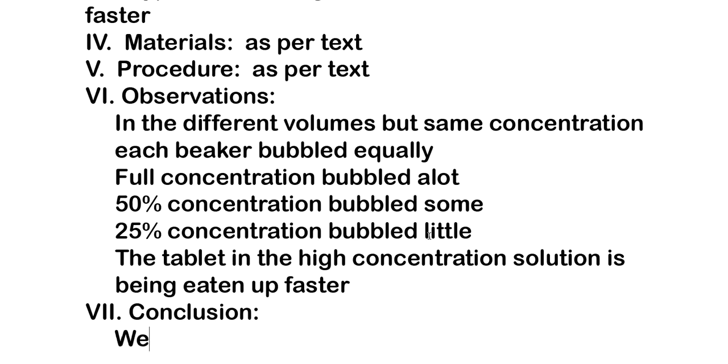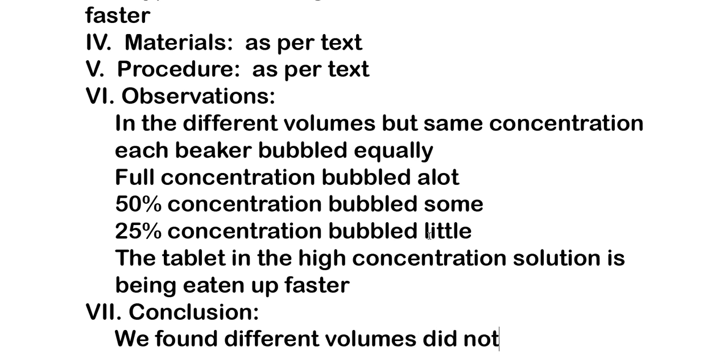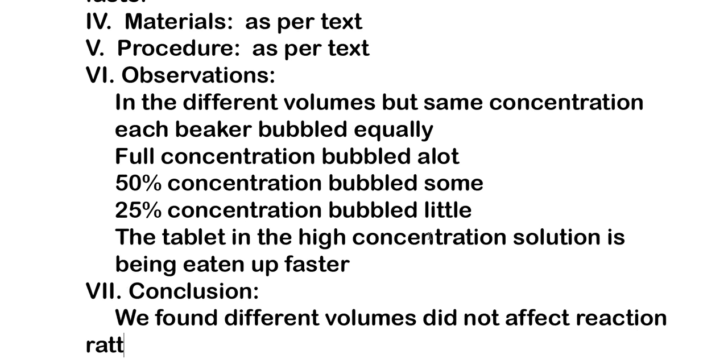First thing we found, different volumes did not affect reaction rate. Remember when we had the 200 milliliters, 100 milliliters, and 50 milliliters? Well, they all bubbled about the same.